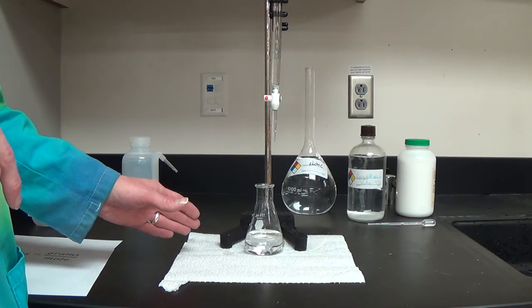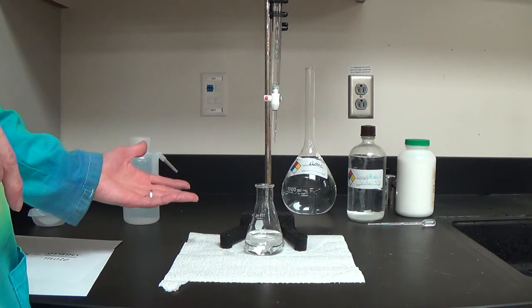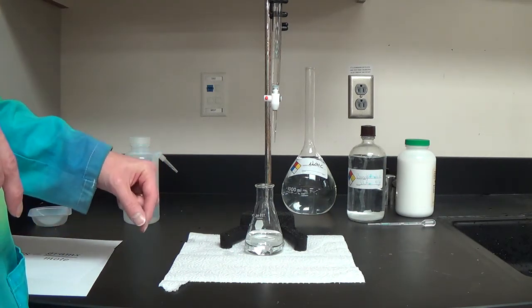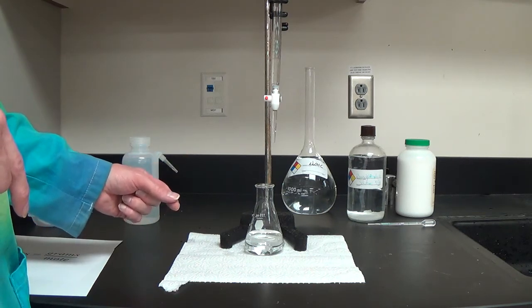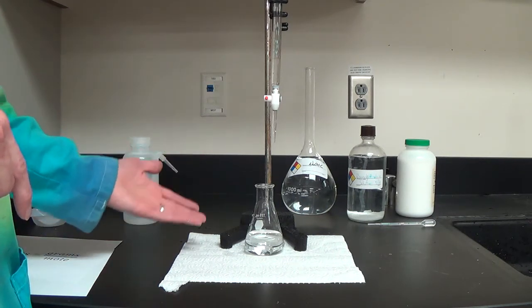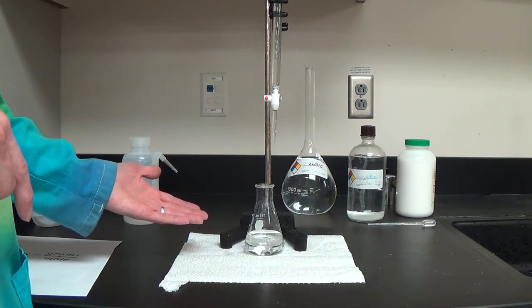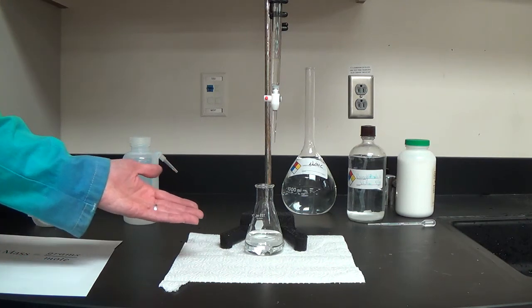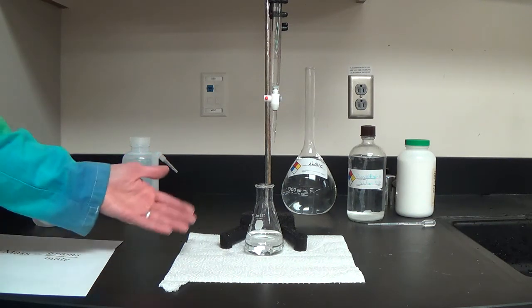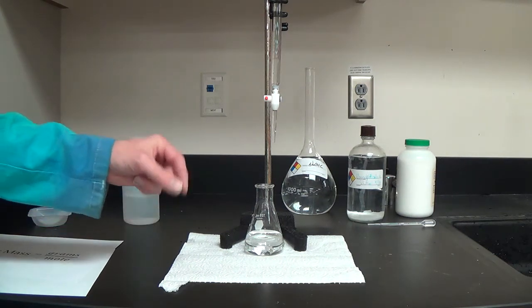There are other indicators that switch at other pHs. Knowing what pH you want, you look up in a chart and see which indicator to use. Officially, around the pH that you want it to switch colors, you want that pH to be equal to the pKa of the indicator. pKa is the negative logarithm of Ka. So you could look in a list of indicators by Ka values and determine whether the pH and the pKa are about the same — that would be a good choice.